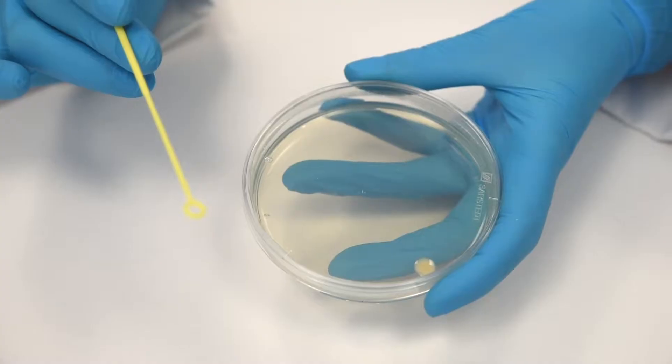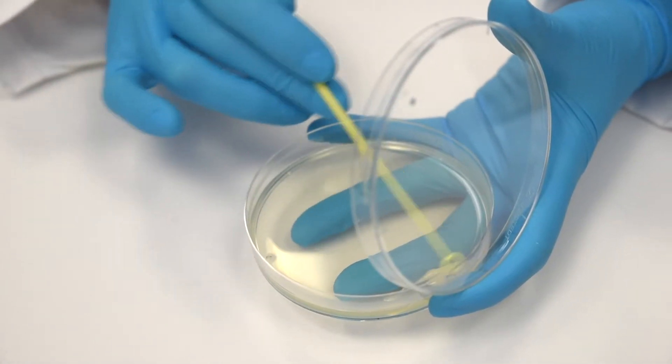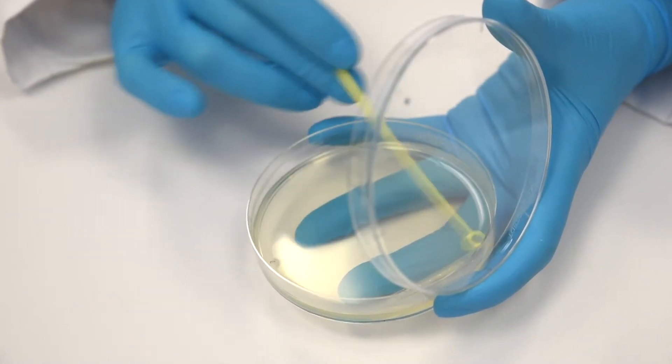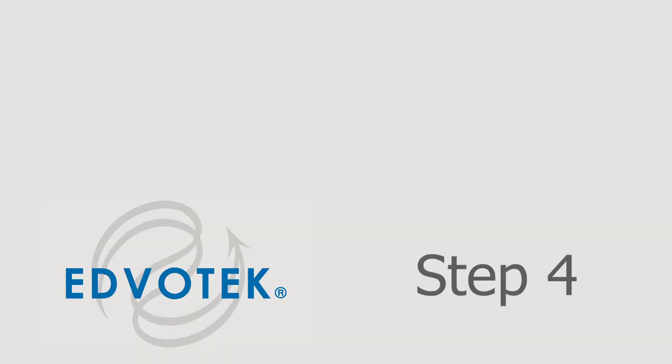Step 3: Streak the loop back and forth through the dissolved Bacto bead to make a primary streak at the top of the plate. Take care not to gouge the loop into the medium.